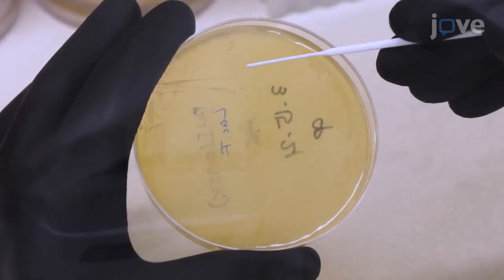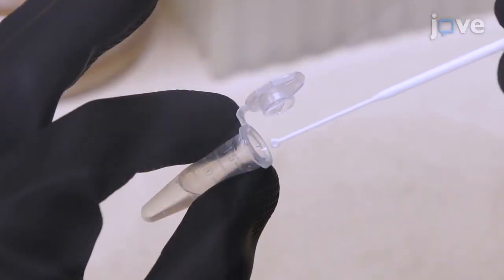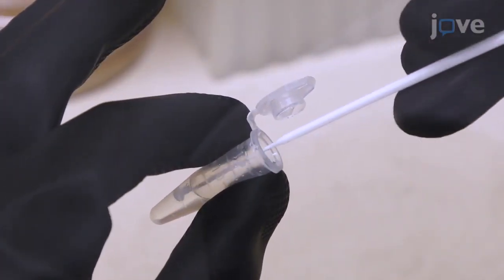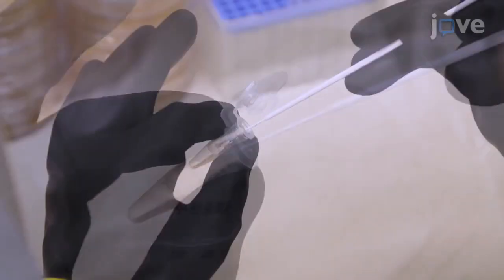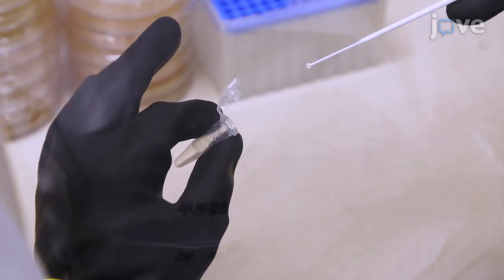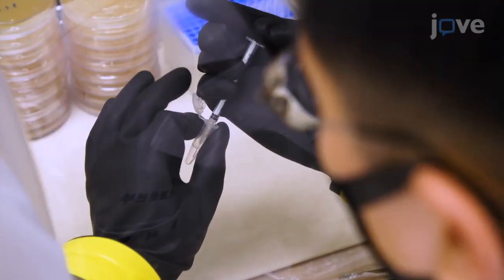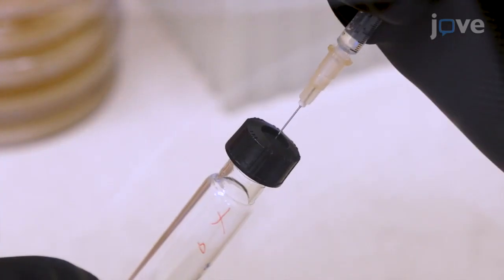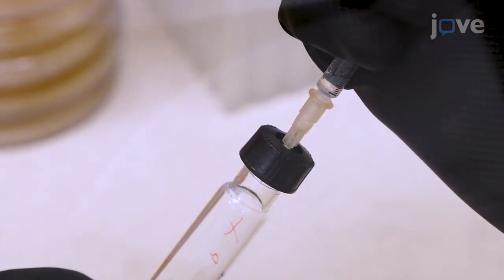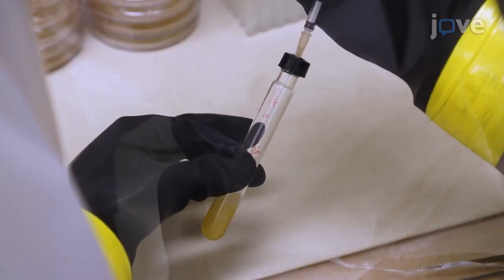Next, use a loop to collect a single colony and place the colony into a 1.5 milliliter culture tube containing 500 microliters of PBS. Resuspend the colony homogeneously within the saline and load the entire bacterial suspension into a 1 milliliter syringe. Insert the needle into the center of the culture tube lid and deliver the colony into the medium.